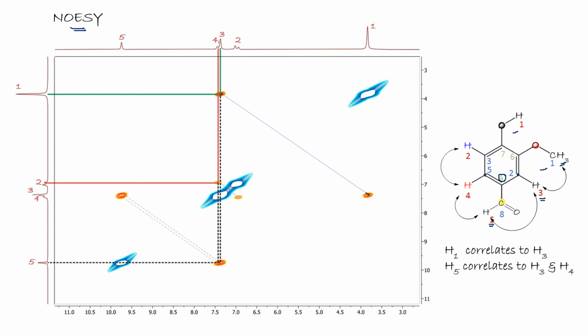That is correct. We have connection between H3 and H5, so H3 with H5.